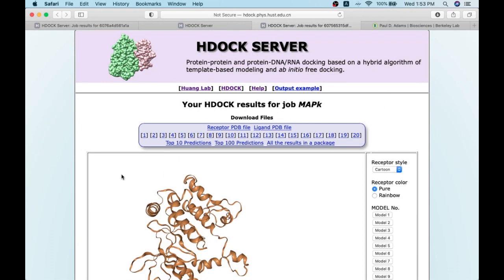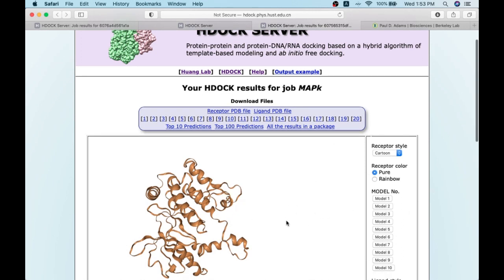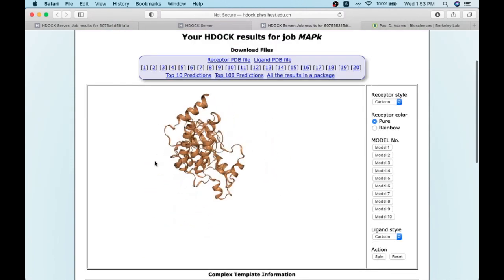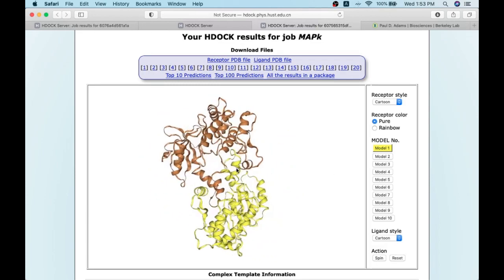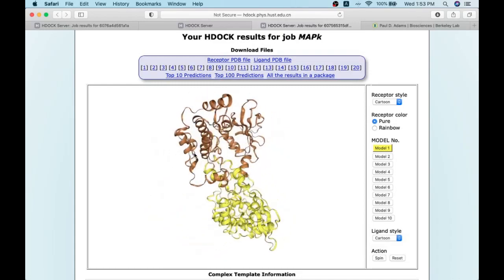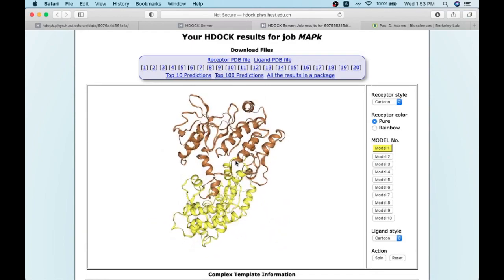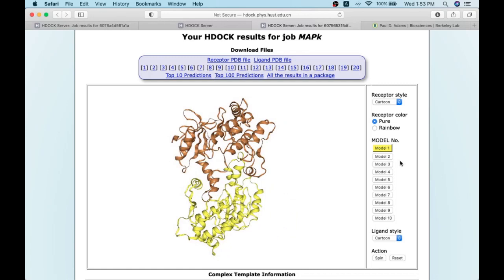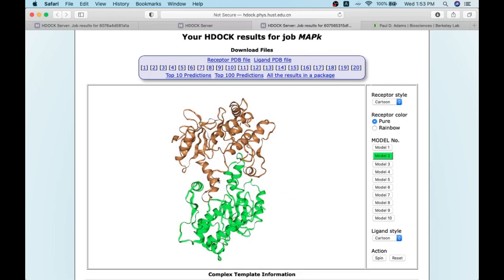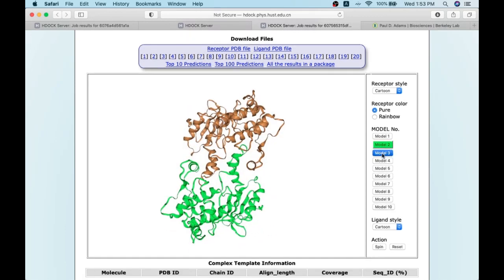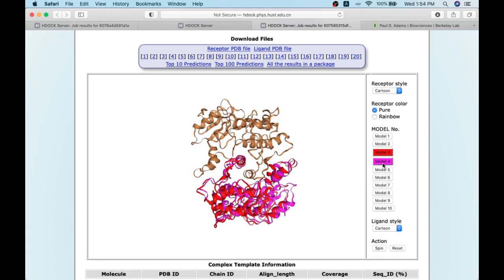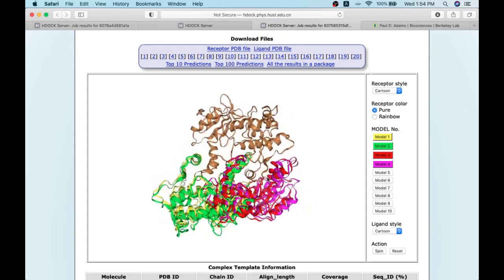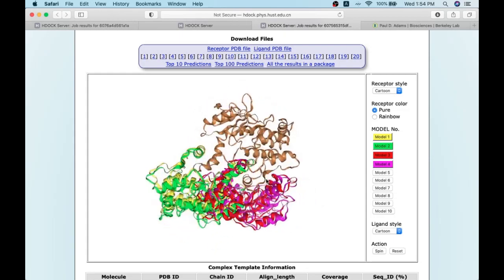Here is the result page. In addition to various scores, HDock provides a viewer interface where you can select the specific orientation of the binding partner. You can see chain A as one molecule and the different orientations of chain B docked to chain A — up to 10 models can be displayed. This protein-protein docking is performed with different orientations, and you can compare all poses to see in which orientation the majority of docked complexes are generated.